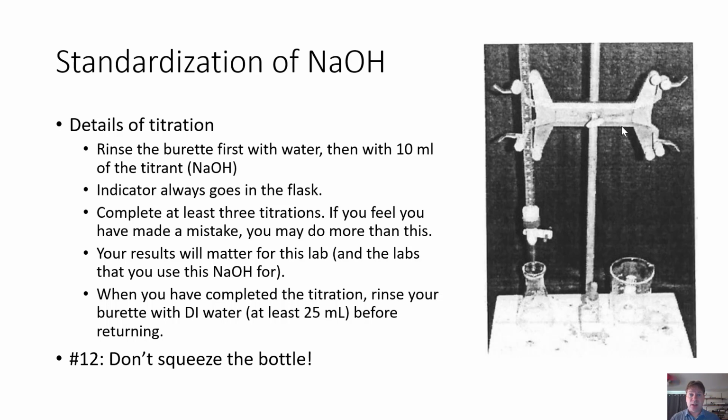There are other clamps that are in your drawer and are in the cabinet. You want to make sure you're picking the right one, and that's the burette clamp. And it has a clamp on either side. That's a double clamp. When you put the burette into the burette clamp, you want to make sure that it is clamping onto that glass tube, and that it is doing so so that it's standing straight up and down, basically. There's a couple of ways to do this incorrectly, so just make sure yours looks kind of like this. If I see you're a little bit off, I'll come in and give you a hand with that.